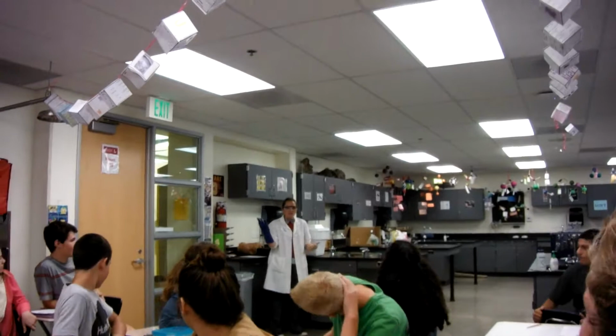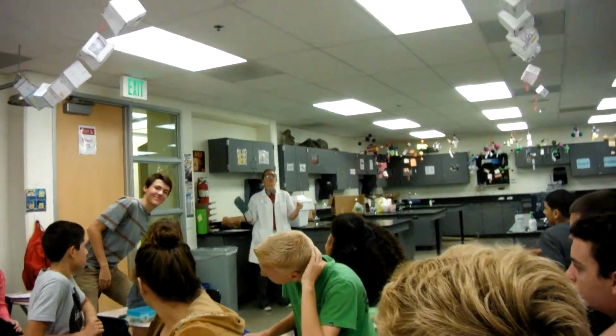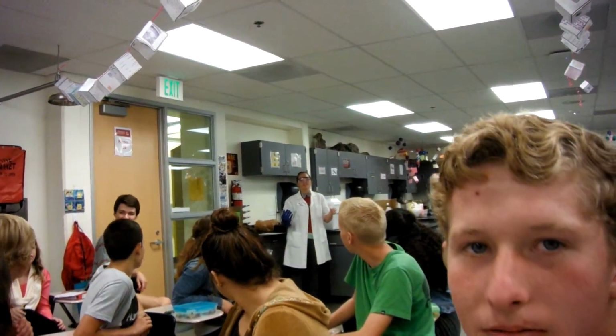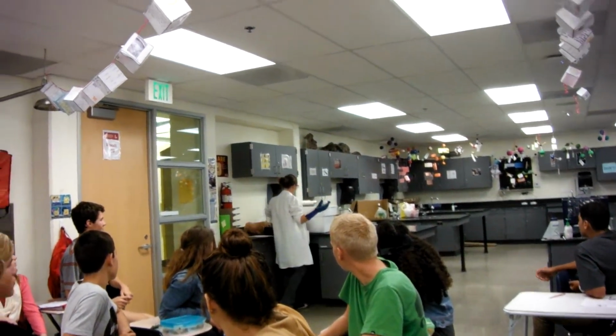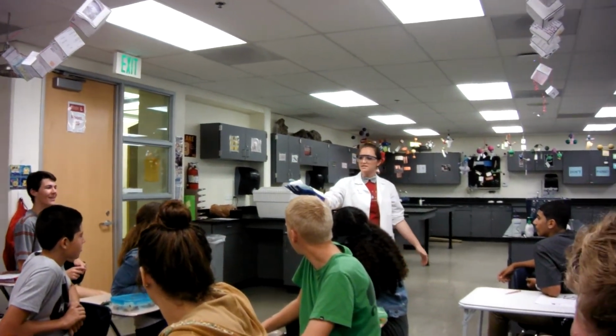It's cold, right? So you gotta protect yourself when you grab it. Otherwise you get instant frostbite. So, that's cool. Alright, so if you look at it, do you guys see the gas coming straight off of it?